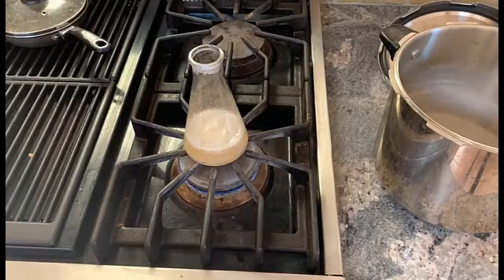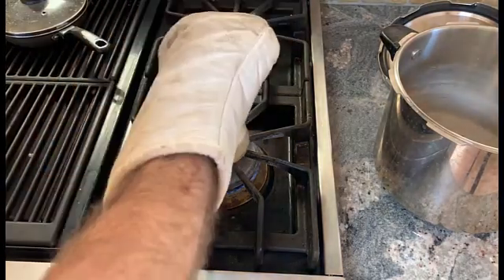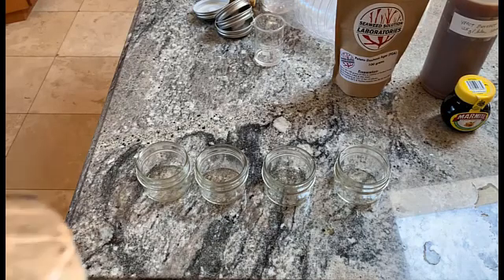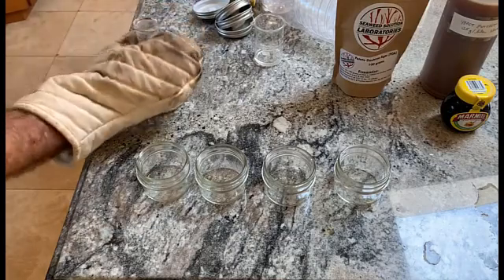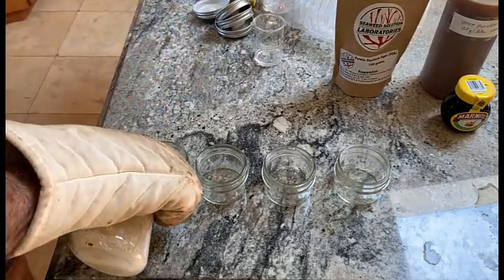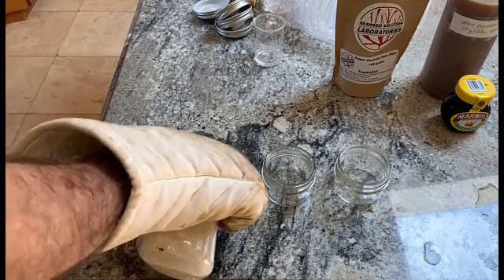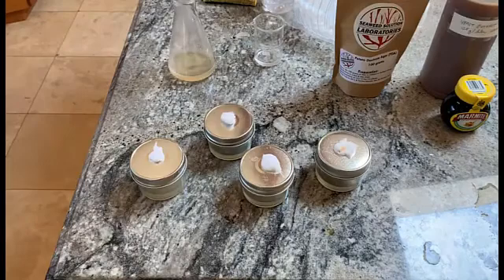The agar is getting close to boiling. I usually make eight of these at a time because that fits comfortably into the pressure cooker, but today I'll just do four as a demonstration. I just want to cover the bottom and that's enough.